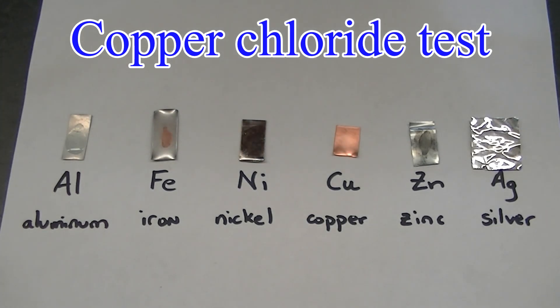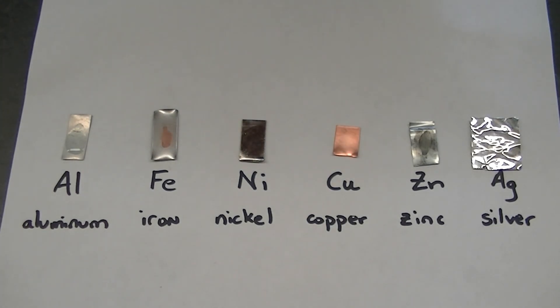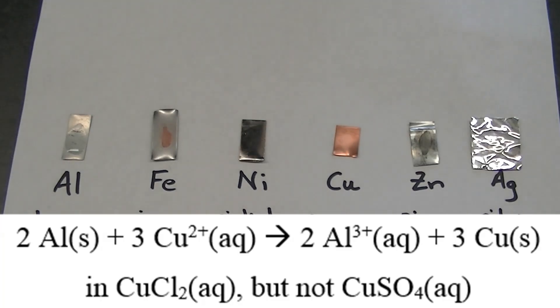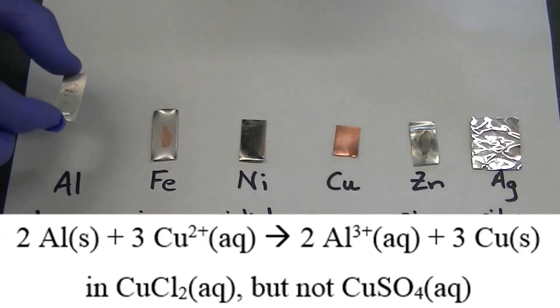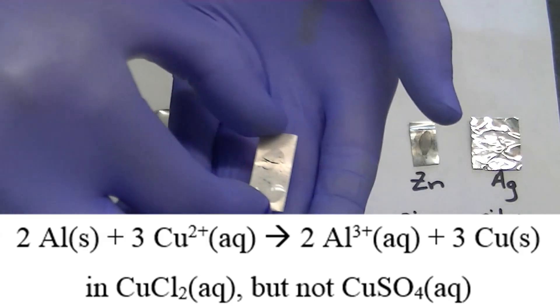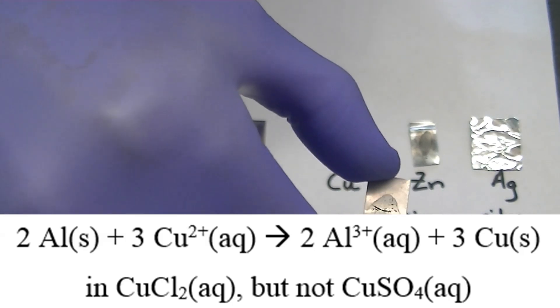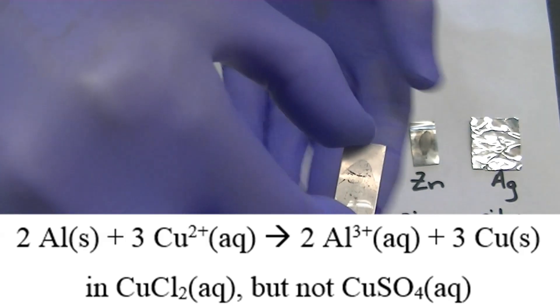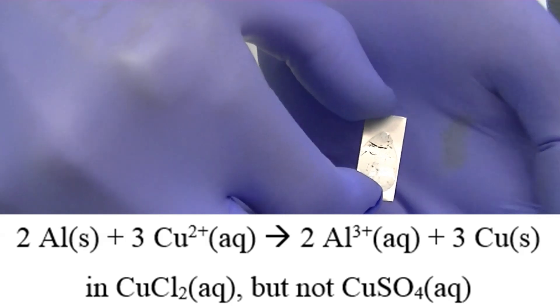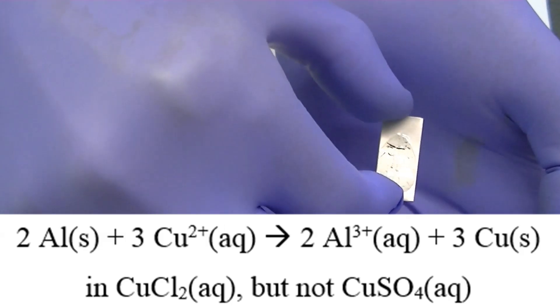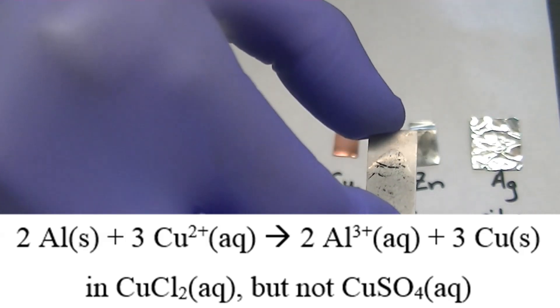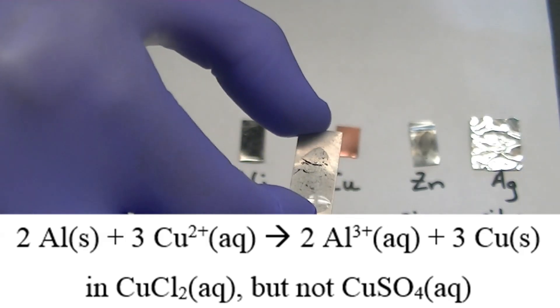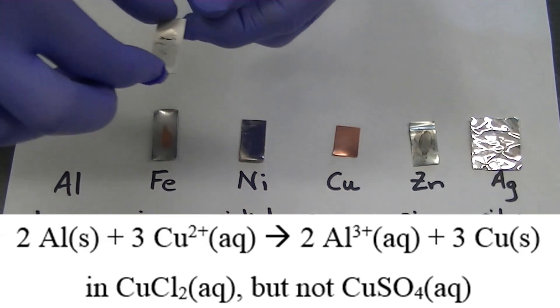Aluminum does react with a solution of copper chloride. Chloride ions enable the dissolved copper to penetrate the layer of aluminum oxide that exists on the surface of aluminum metal. This penetration of copper ions allows the aluminum to react with the dissolved copper to form dissolved aluminum and copper metal. If you look closely, you can see some flecks of copper metal forming on the surface of the aluminum metal.